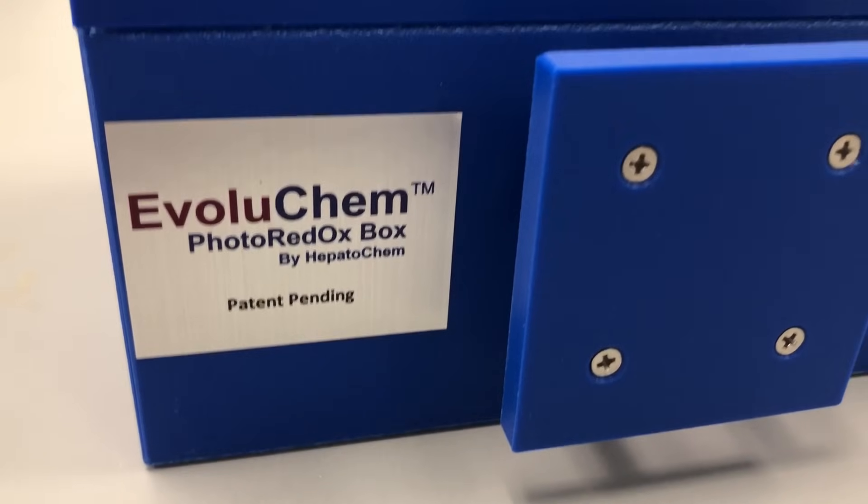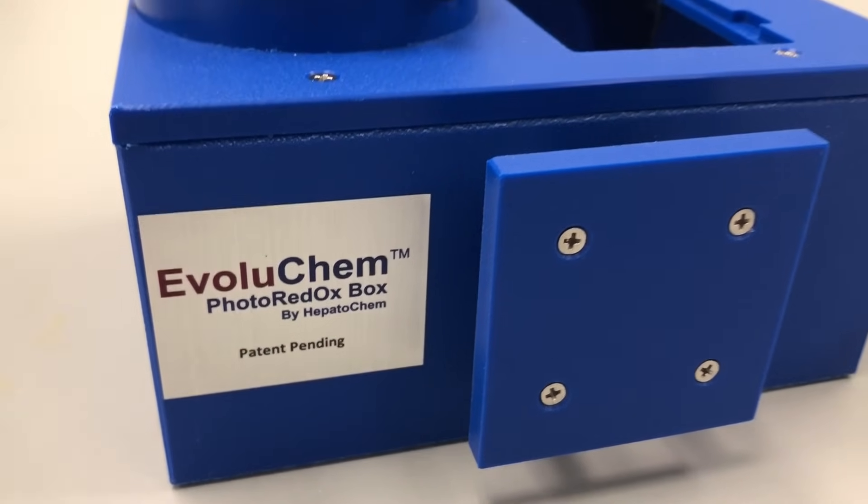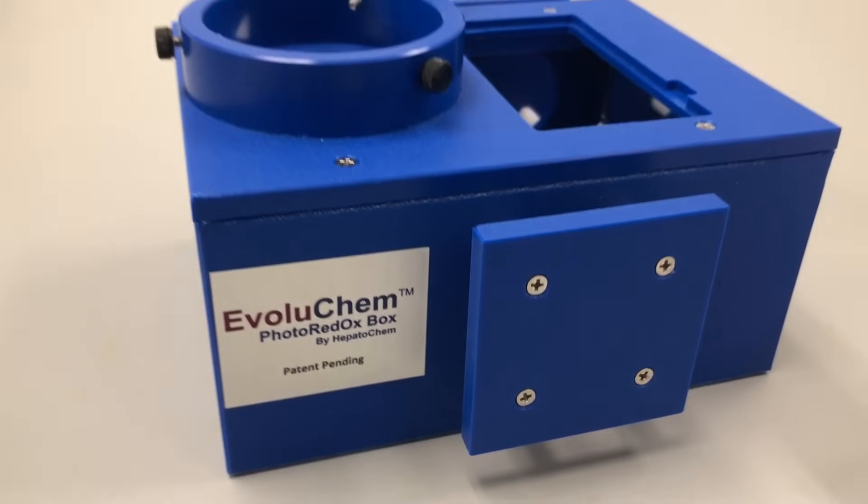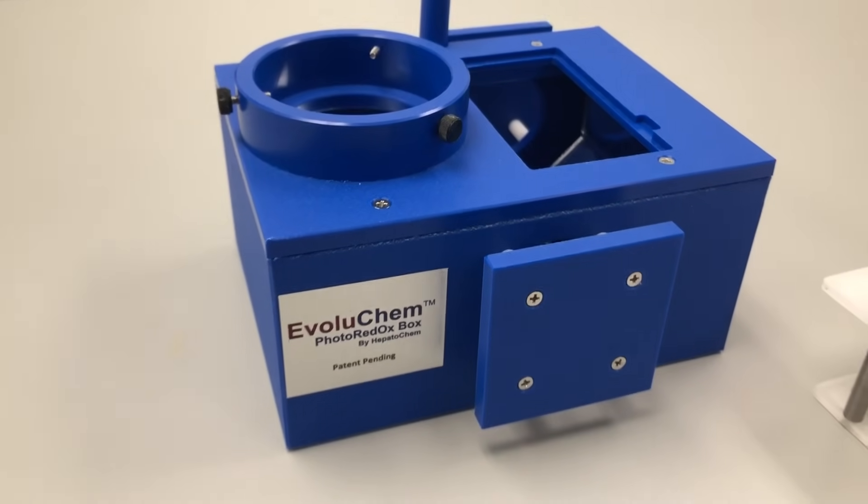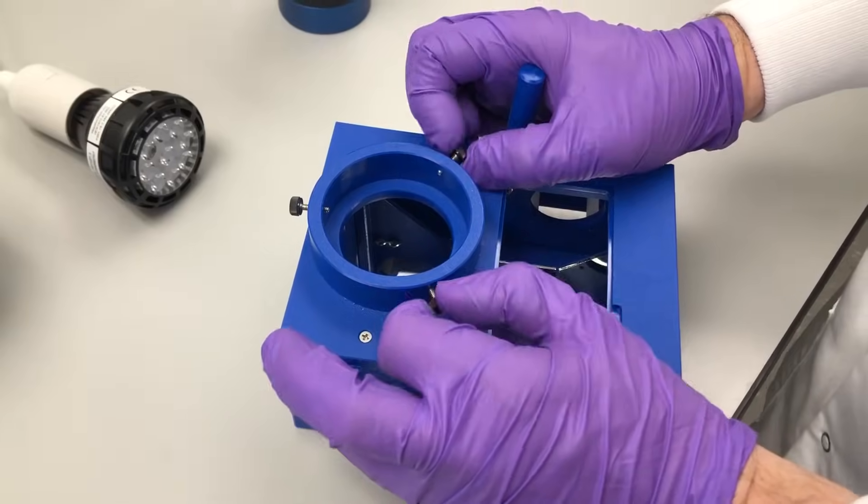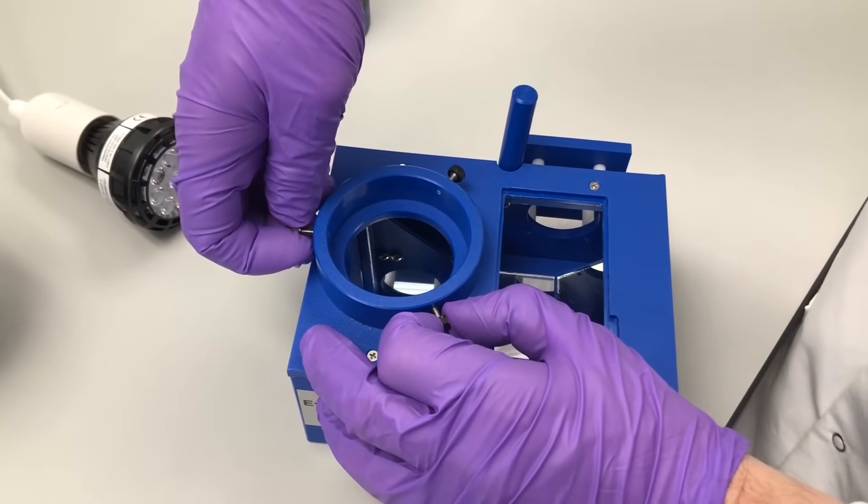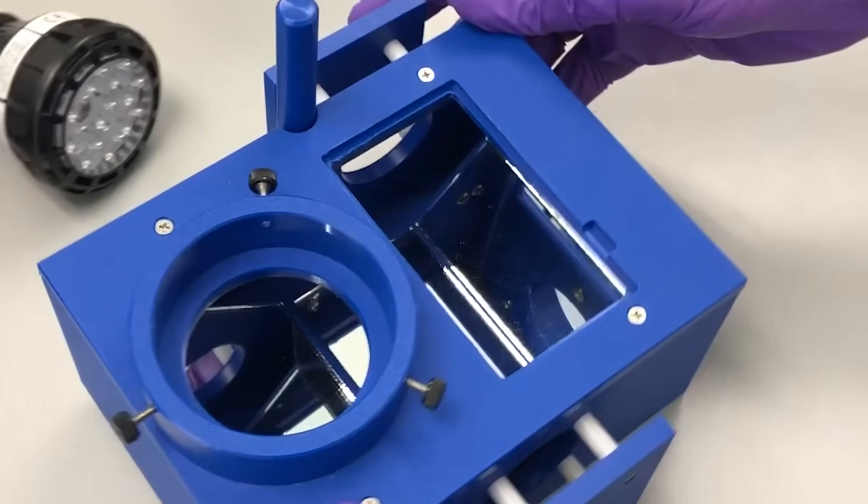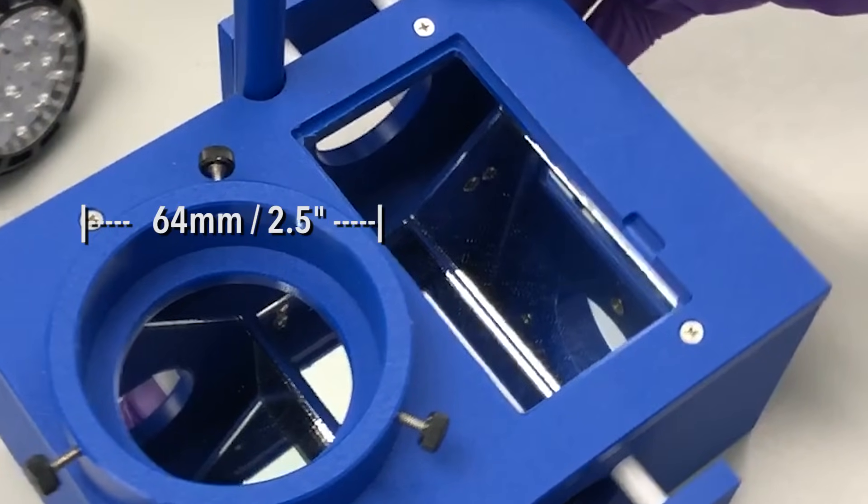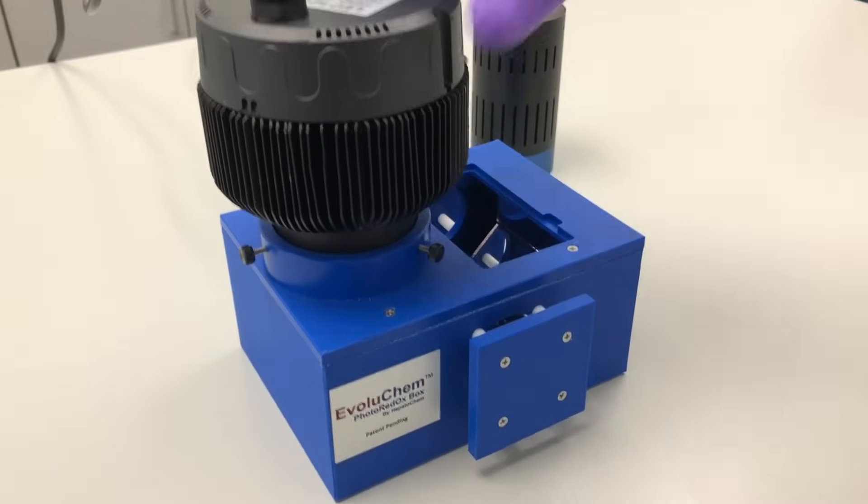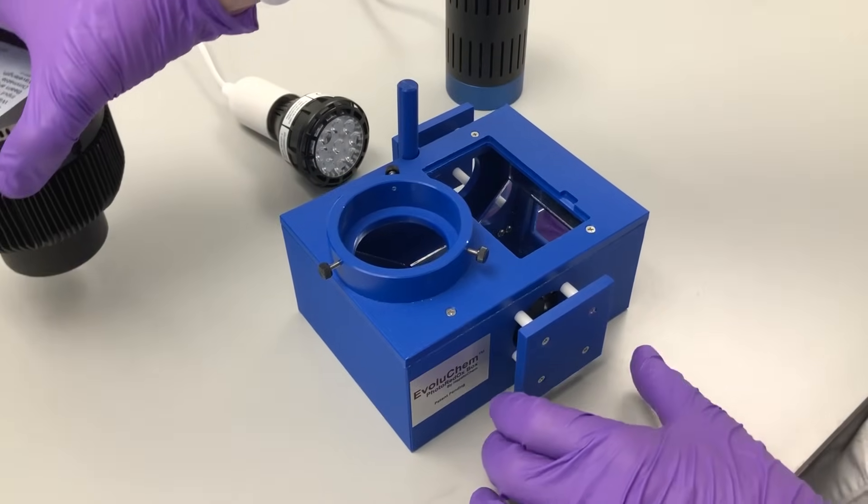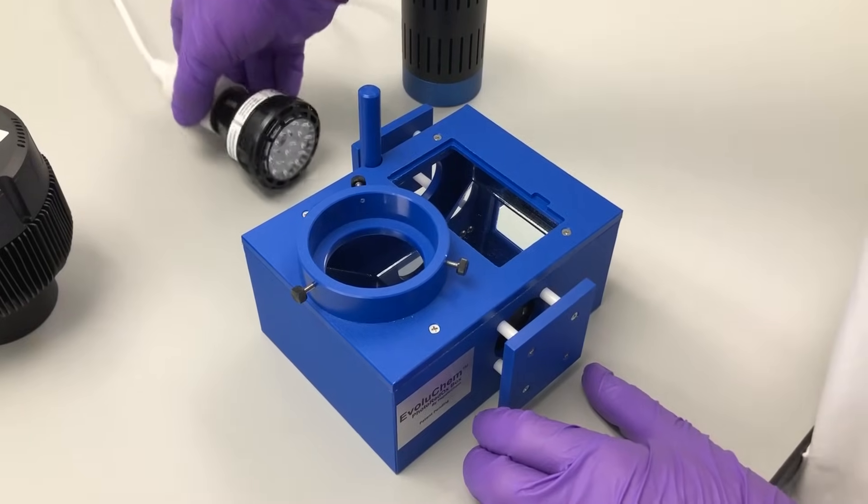EvoluChem photoreactors have been engineered with a universal light source mount and optimized to ensure easy switching of multiple light sources. The mount is fitted with three adjustable screws to hold light sources that are smaller in diameter than the 64 millimeter or two and a half inch mount cylinder or are too light to stay in position on their own. Do not over tighten the screws to avoid damaging your light source's housing.